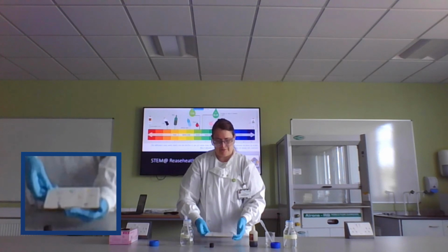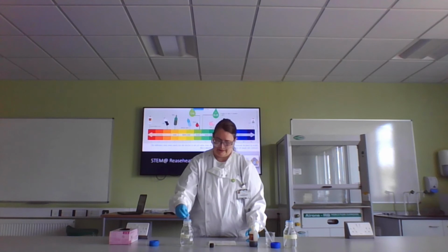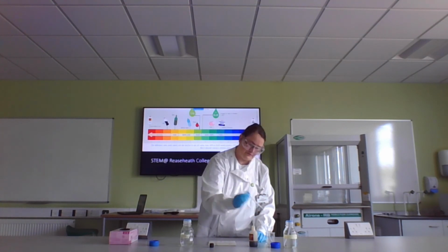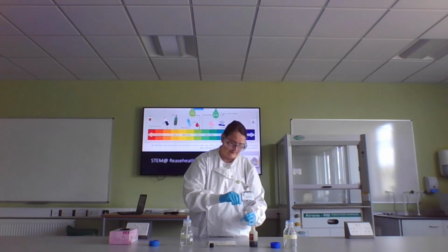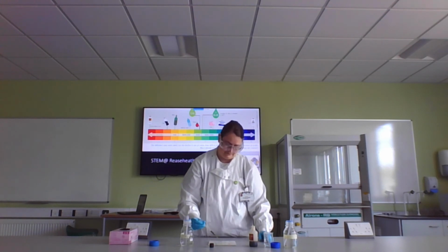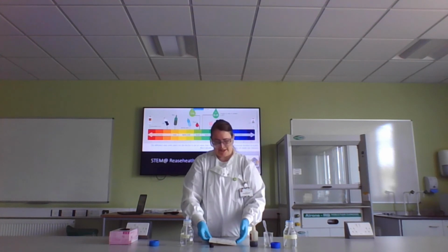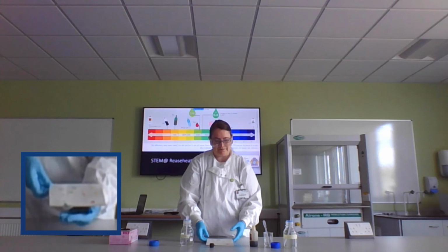I've got a yellow. Really getting all the colours of the rainbow here. I'm just going to have 2 more drops. I think that might be all we need. Ah, there we go. And that's perfect. We've got a lovely green pH 7 solution.